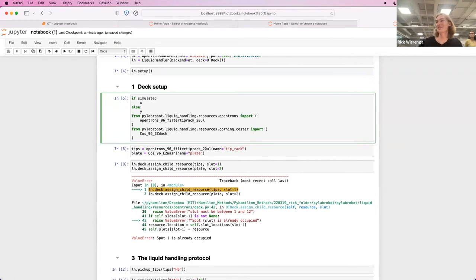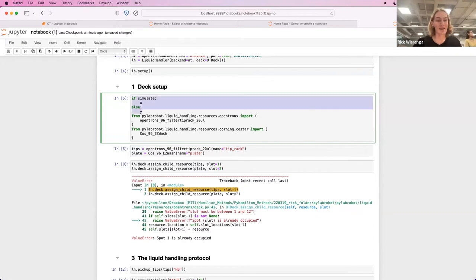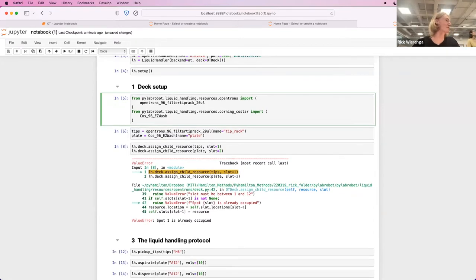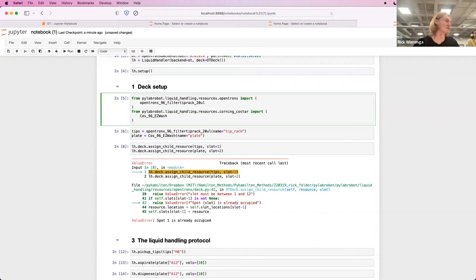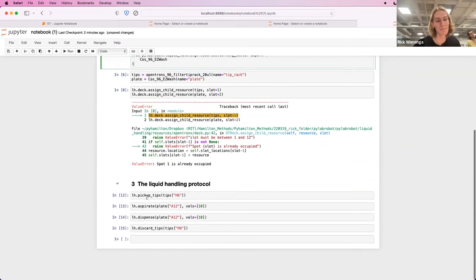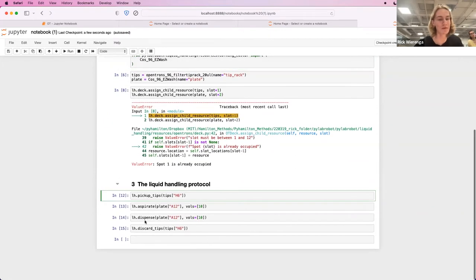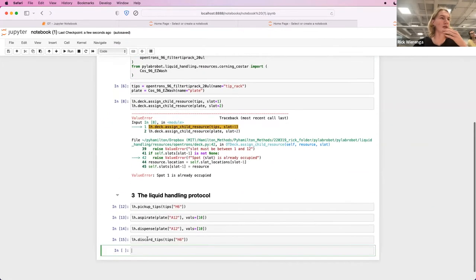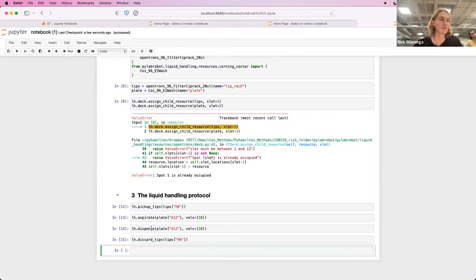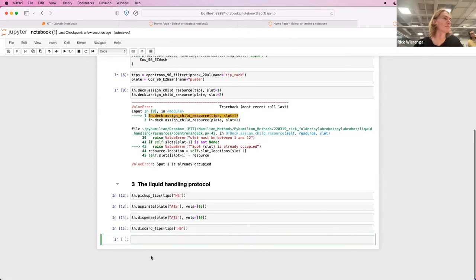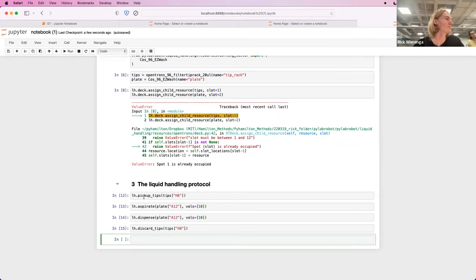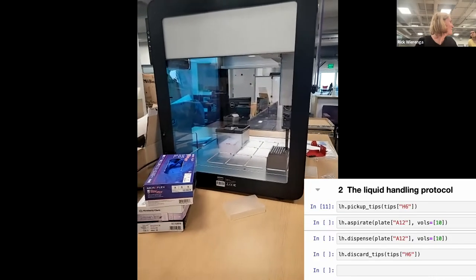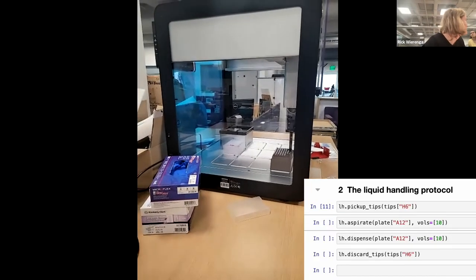I haven't done this, but in a real script, you would import a file that sets up your simulator environment or something. And an important point is that in this demonstration, it looks like it's a lot, but generally the liquid handling protocol itself is incredibly long. Like thousands of lines of code. So this is really just the first couple of steps to initiate whether you're on the robot.